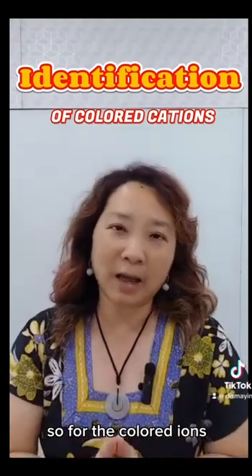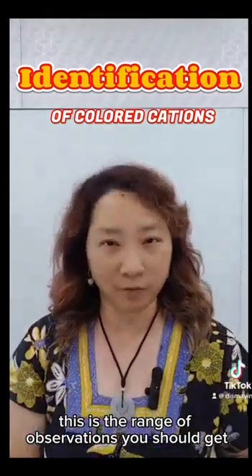So for the colored ions, this is the range of observations you should get.